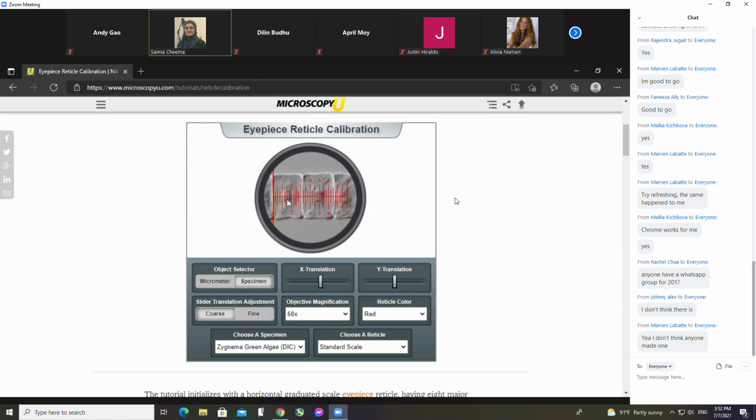So I can move that around a little bit and figure out maybe the width of these cells. So maybe this one. What I noticed is that it's almost 3.5 units. That's all it is, 3.5 units. It's not 3.5 millimeters or micrometers, nothing. And units are not a very repeatable measure.